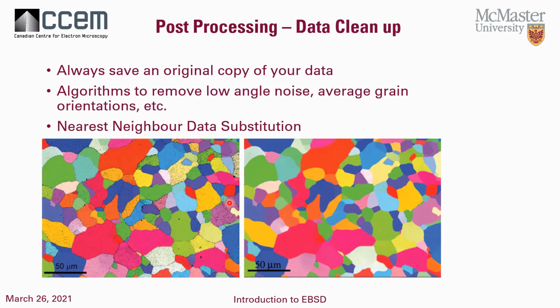You also, and this is a very common thing to see in EBSD, this particular material, the reason it has so many zero solutions is actually because it has phases within it, within the grains and at the grain boundaries. So you are actually eliminating the places where you didn't get any results because there's a different phase there. So you will quite often see this in aluminum alloys, where you will just get a nice map of the aluminum, but all the basic precipitates and phases are ignored in the map.